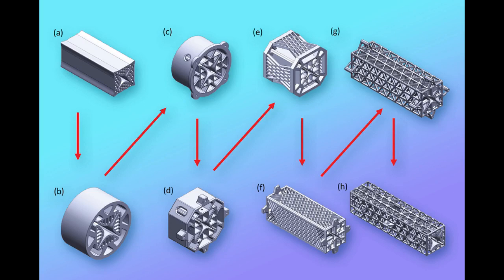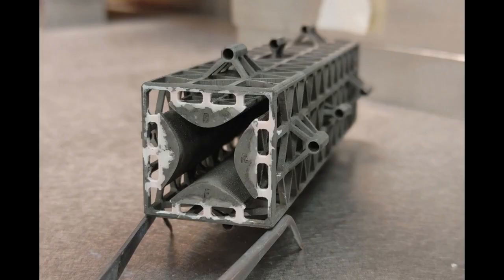A quadrupole, a common type of mass filter, is composed of four metallic rods surrounding an axis. Voltages are applied to the rods, which produce an electromagnetic field. Depending on the properties of the electromagnetic field, ions with a specific mass-to-charge ratio will swirl around through the middle of the filter, while other particles escape out the sides. By varying the mix of voltages, one can target ions with different mass-to-charge ratios. While fairly simple in design, a typical stainless steel quadrupole might weigh several kilograms.